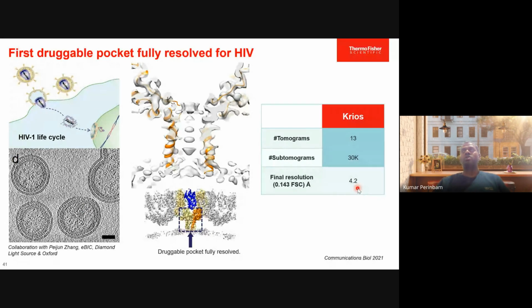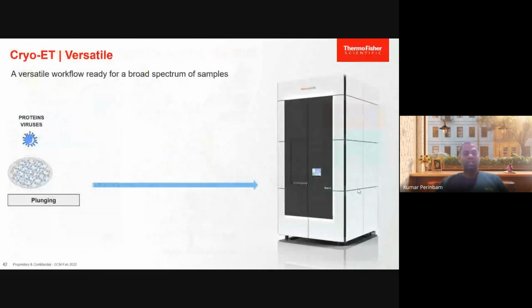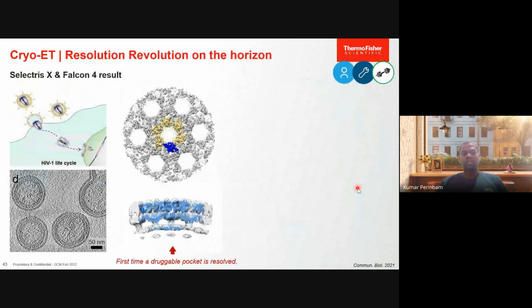So imagine yourself as a virus. You can take a picture of yourself and actually see every single protein on your hand, a face, or an eye. That's the kind of powerful tool cryo-EM and cryotomography can offer. All these things are quite simpler in the case of a virus.